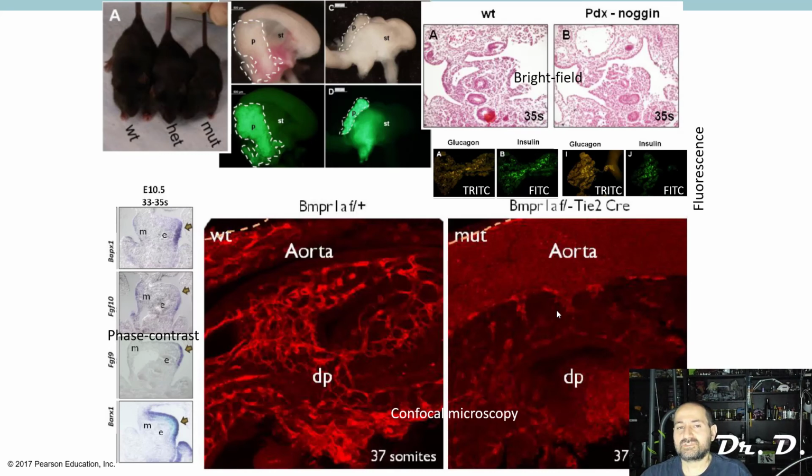A lot of nurses do research, and they're working with microscopes, so you might be able to see a fluorescent microscope one day, or a confocal microscope one day, or a bright field microscope. Obviously in the lab we're going to see bright field microscopes. Oh, and by the way, look at this. In these pancreata, by the way, the plural for pancreas is pancreata, believe it or not. Not pancreases. Pancreases is not the correct term. It's pancreata. Yeah? You learn something new every day.